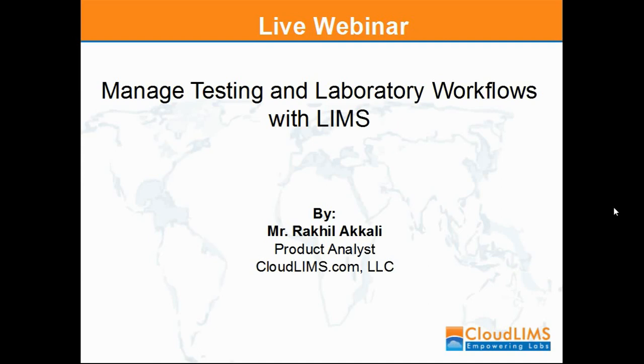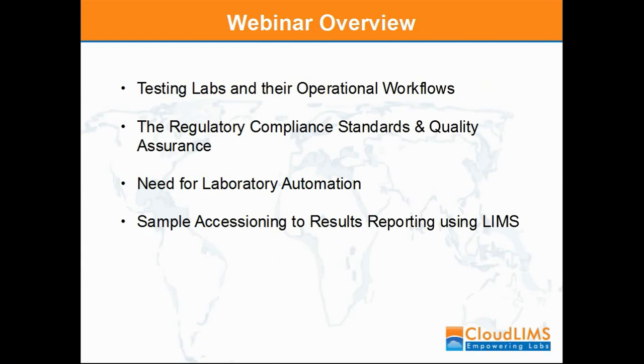Thank you for the introduction, Mrinal. The main focus of our webinar today would be on the typical jobs undertaken in a testing lab, what regulations they follow, and how that helps with quality assurance. The need for automation of laboratory workflows and how a LIMS can help ease testing lab operations. I will also discuss how testing workflows can be automated right from sample accessioning and tracking, management of tests and test results, to creation of professional reports.